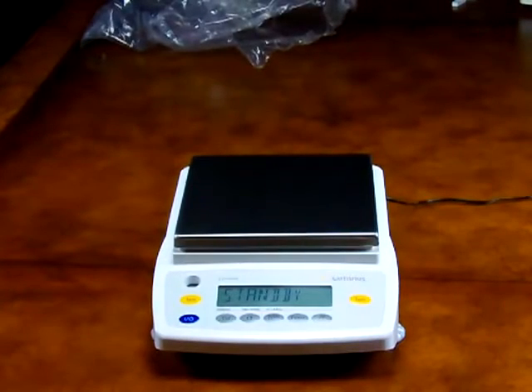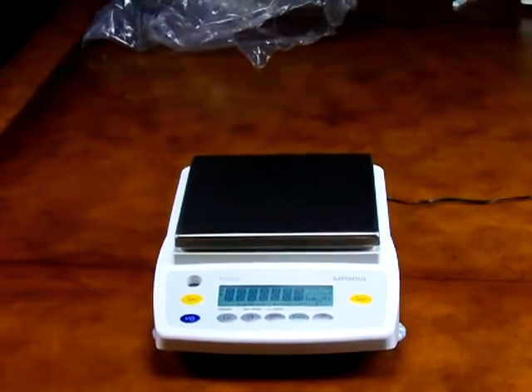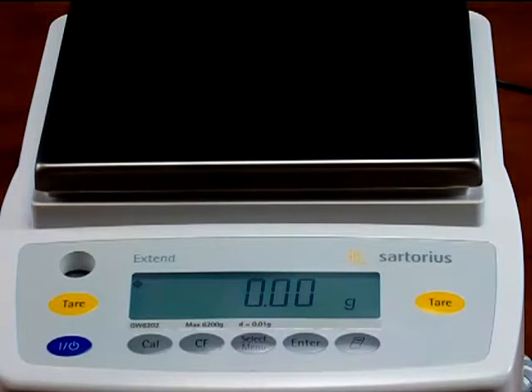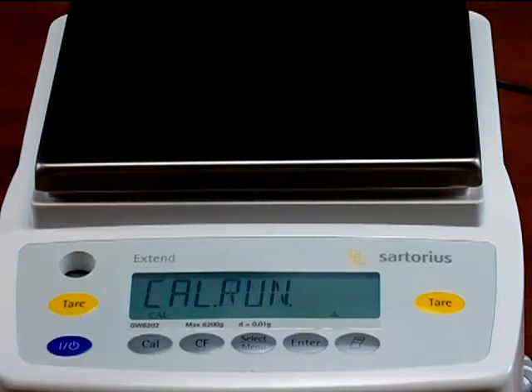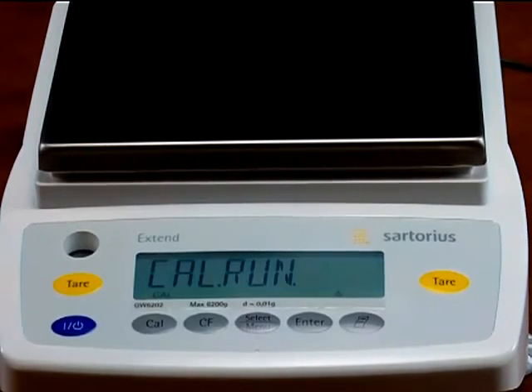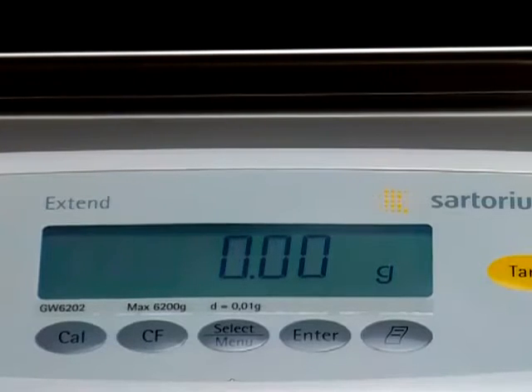The operation of the balance is simple. Press the blue on/off button to power up the balance. Notice the LCD segments all illuminate in the power-up test. The balance goes to 0.0 grams. Simply press the cal button to initiate the motorized internal calibration. The balance drops the internal calibration weight to perform the calibration. The display shows CAL-N and now the balance is ready to weigh.